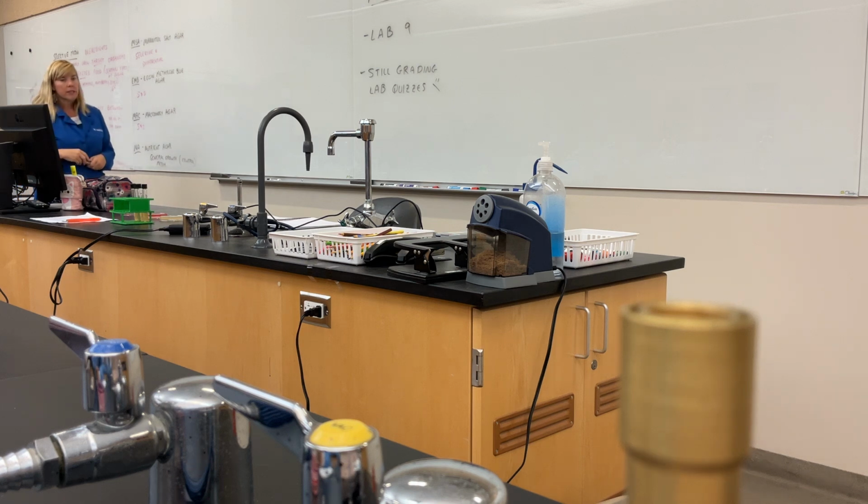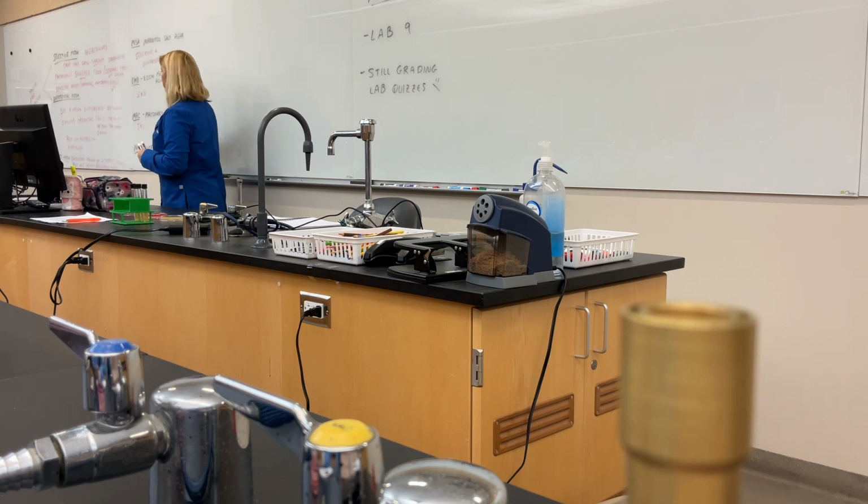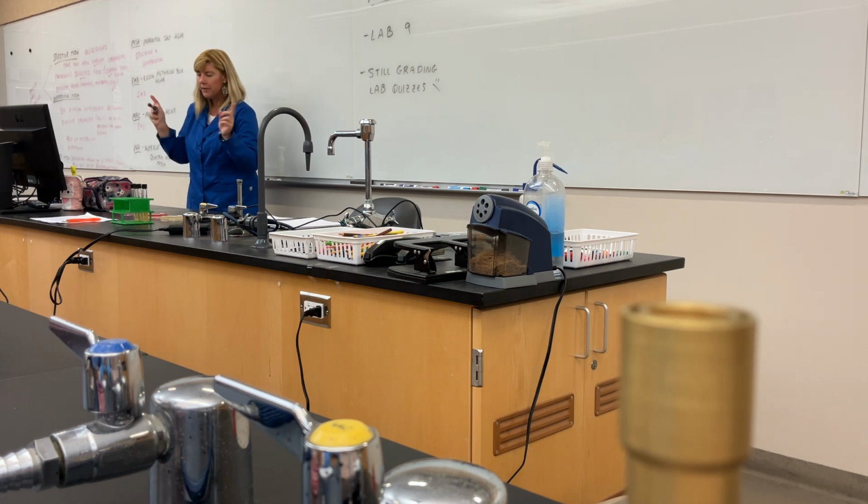Now, the mannitol salt agar is going to be, do I want to go into this now? Maybe I'll wait. I think I'll wait and go into depth on these next time when we have our results in front of us, and we'll start talking about the different ingredients. That way you guys aren't having to listen to me lecture too long. I always hate to lecture too long in lab. I feel like that defeats the purpose.